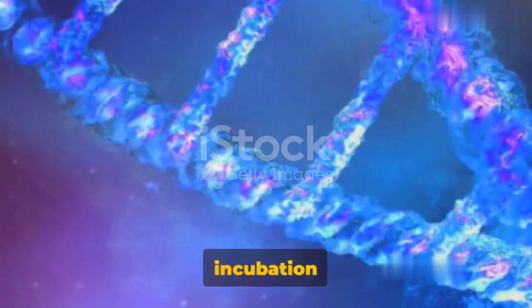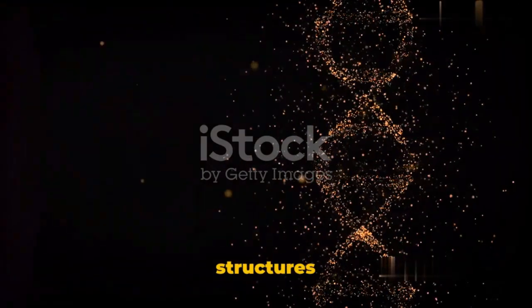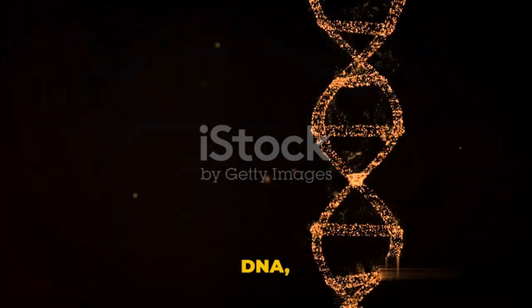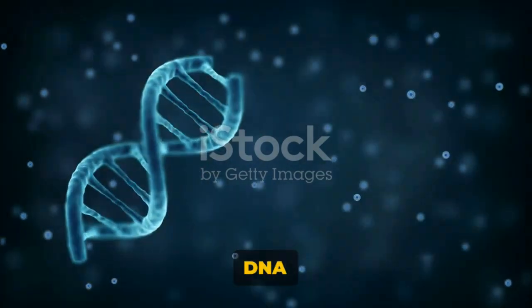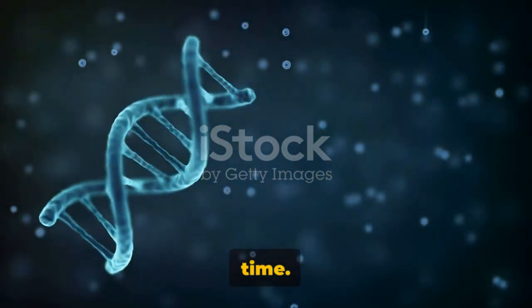Similarly, high-temperature incubation is used to melt our double-stranded DNA into single strands and loosen secondary structures in single-stranded DNA. The highest temperature that the DNA polymerase, the enzyme that synthesizes DNA, can withstand is typically used, usually around 95 degrees Celsius. If the DNA has a high GC content, we might need to increase the denaturation time.